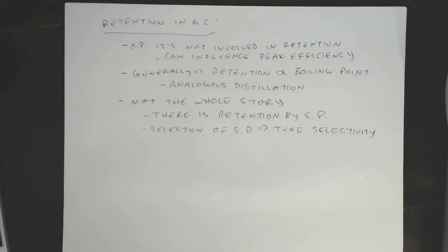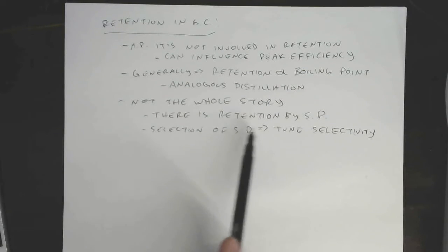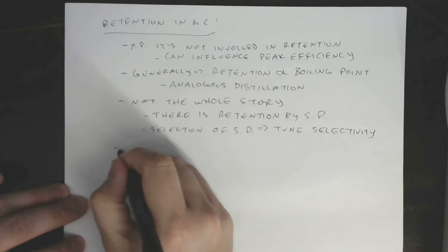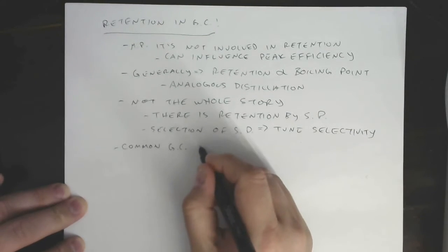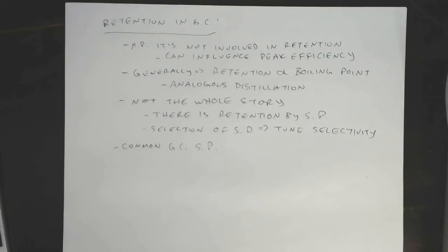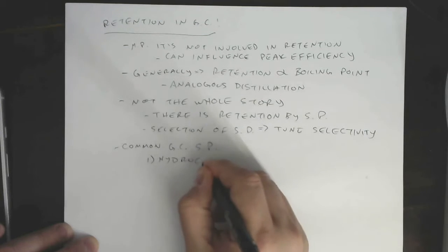class of molecules. So let's look at a couple, before we talk about how we're going to characterize this retention, because we have some quantitative ways of doing this. Let's look at the molecular structures of some common GC stationary phases. I've put these into three really common categories and then kind of a bucket for catching everything else. So four categories. The first one, we'll call these just hydrocarbons.